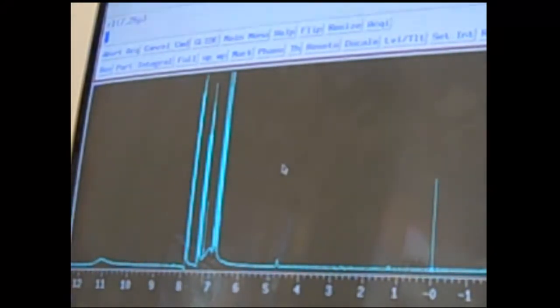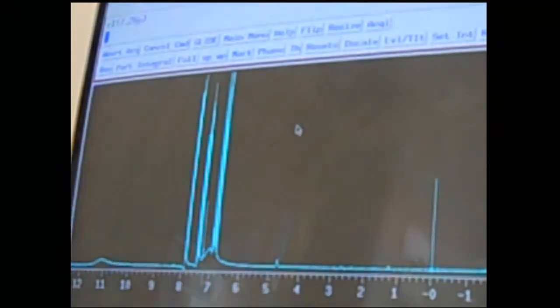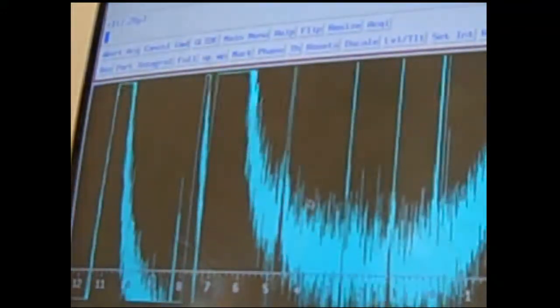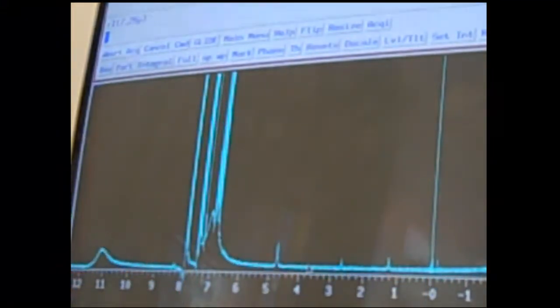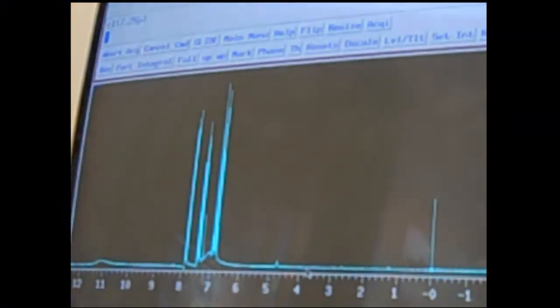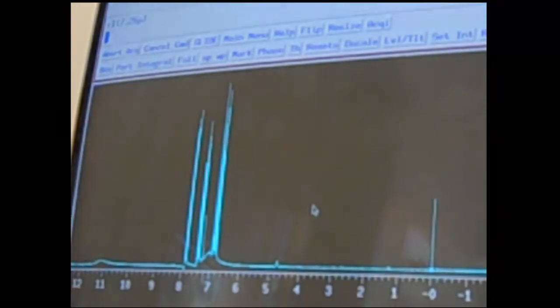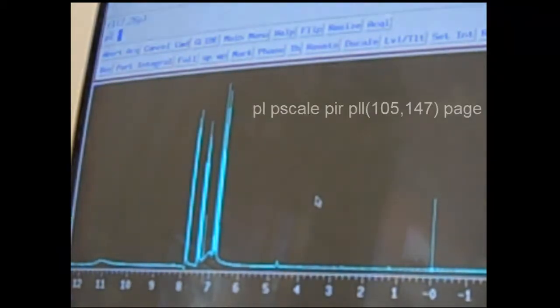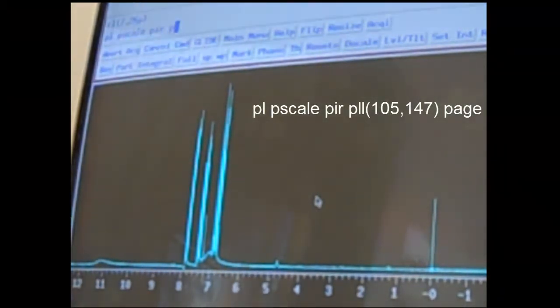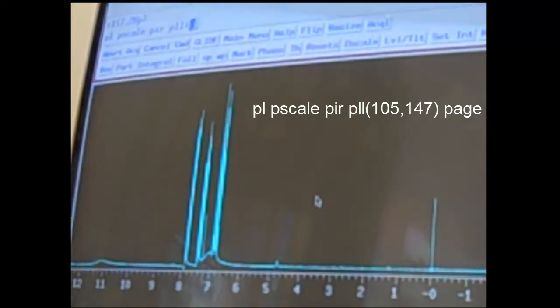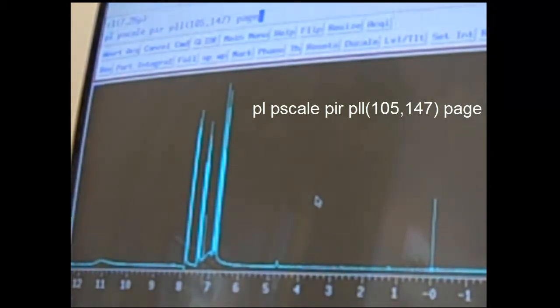Let's say at this point the peaks are maybe a little bit high. You'd like to lower them slightly. By middle-clicking and then dragging down, you can make sure all of those peaks fit on the screen. In order to print, there's a series of commands that you'll type in: PL, PScale, PIR, PLL, and PAGE.